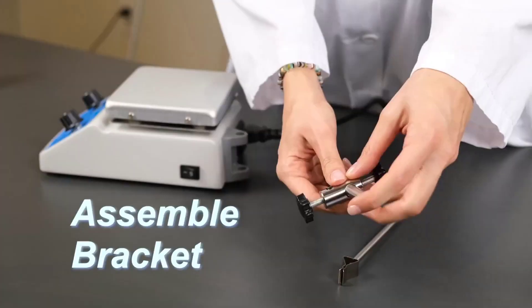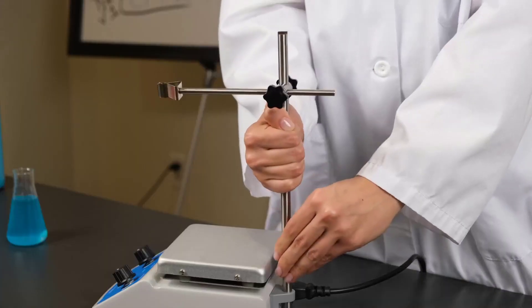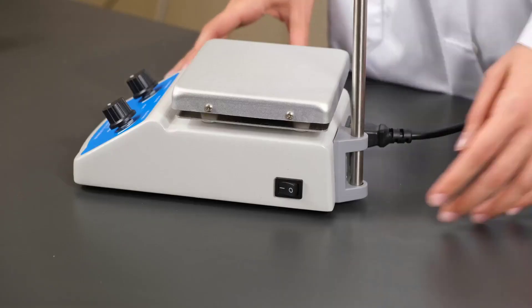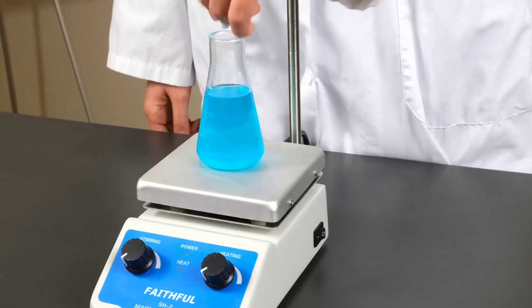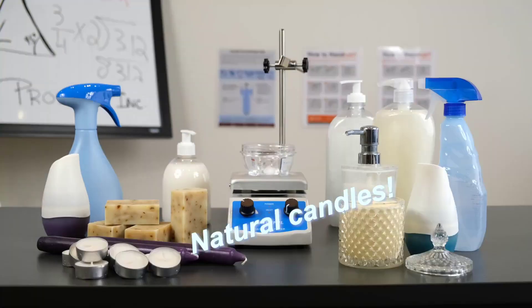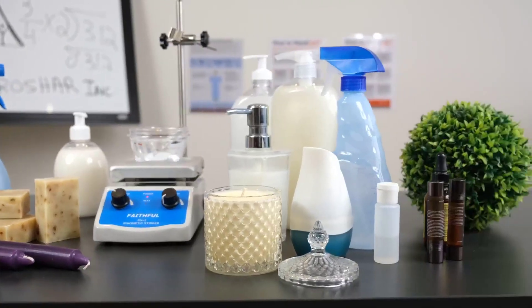For home brewers stirring yeast starters and scientists working in laboratory settings, magnetic stirrers provide a convenient means to thoroughly mix your substance of choice. Our list includes basic, affordable models suitable for hobbyists, as well as some top-end devices aimed at professionals with built-in heating elements and digital readouts.